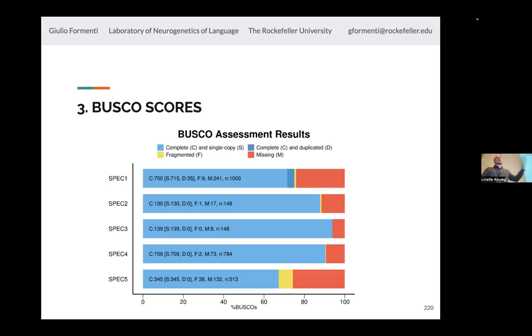Or, for instance, when you try to map your reads, they will map to both copies, so you don't understand what's really going on. And duplication is easy because, again, we have sequencing errors. Sequencing errors tend to mimic real variation. And so if you don't recognize them as sequencing errors, you may infer, oh, there are 2 copies of this region, and then infer multiple gene duplication events.